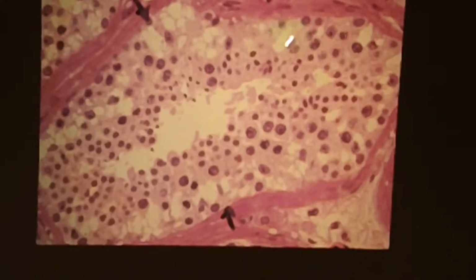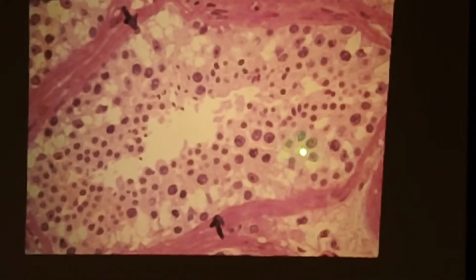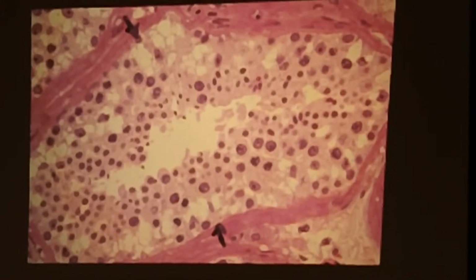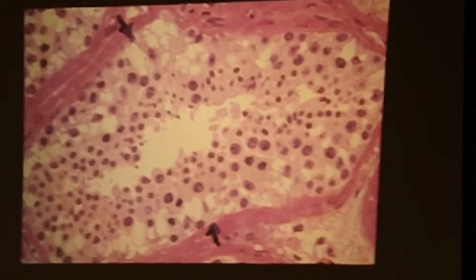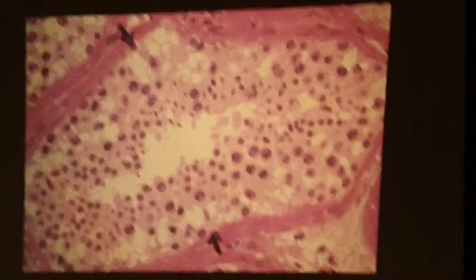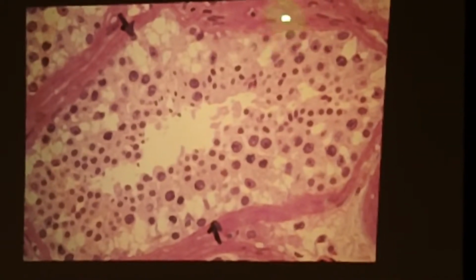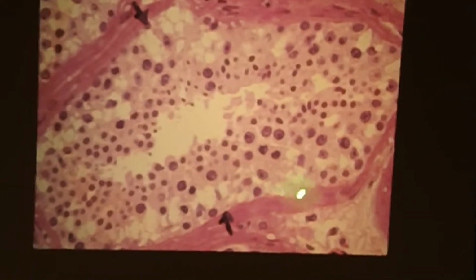All right? Another one, another one. Here's one right here, here, here, here. So once you get your search image honed in on it, they're everywhere, as you expect them to be. If we think about the spermatogonia, these nice round nuclei, cells that are resting on the surrounding basement membrane.